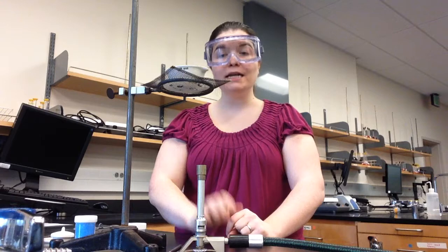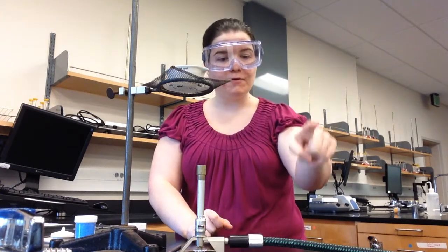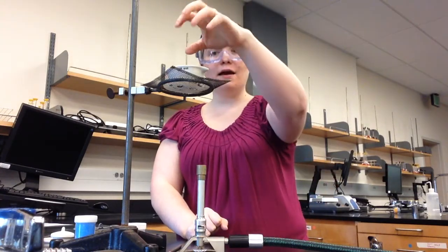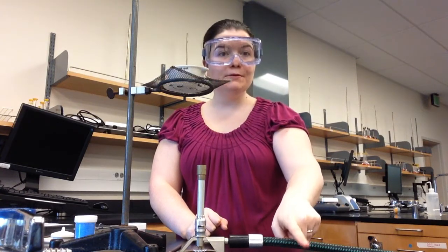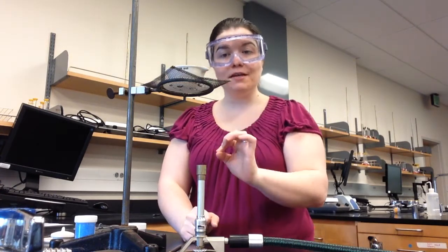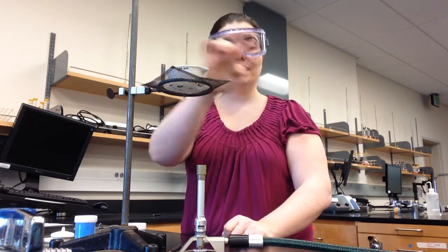You should be careful when heating the blue chemical. You want to do so gently. If you heat the chemical too strongly or too quickly, little pieces of chemical will pop out of the evaporating dish onto the lab bench, and it'll look like there's a little dusting of white particles. You want to keep all of the chemical inside of the container, so if any of it pops out, you're going to be losing mass in the wrong way. You'll need to start the experiment again. So you should heat very gently so that you're heating the chemical to remove the water, but not heating it strongly enough that the chemicals can pop out.